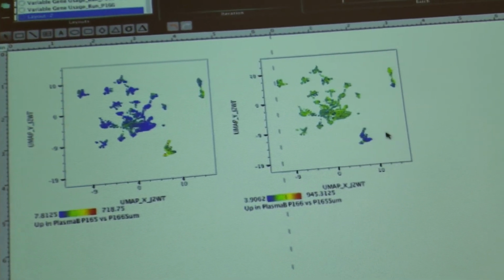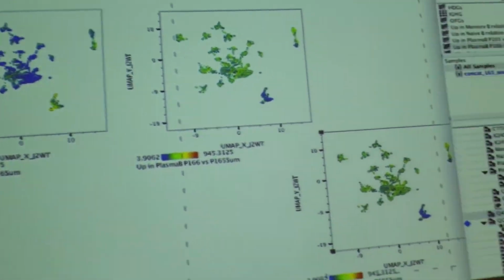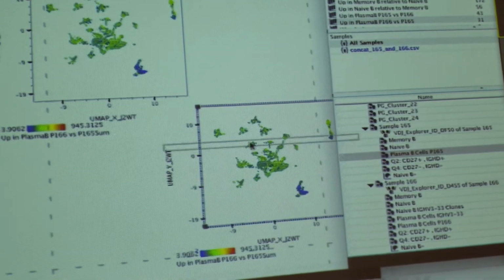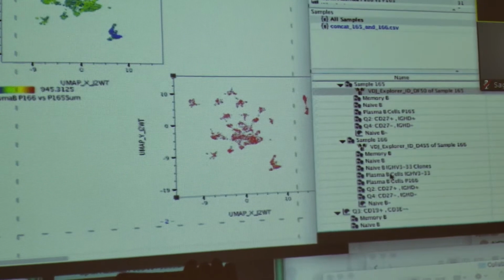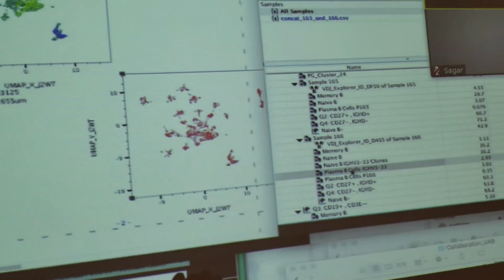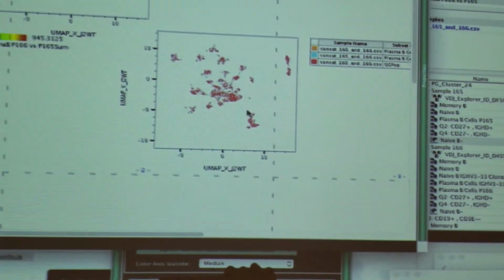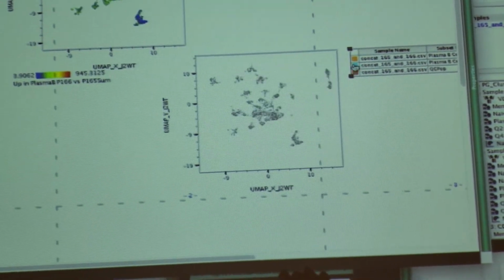Right. So is there a way to, I guess, but which ones, what are those little subpopulations? I know you draw gates around them, but for example, if you want to know one by one, I guess I kind of suspect those are different. We have these populations of plasma B cells from the two different patients. And we can look at where those plasma B cells are in relation to these different islands. Right. Can you do an example of one of those? Just pick an island.